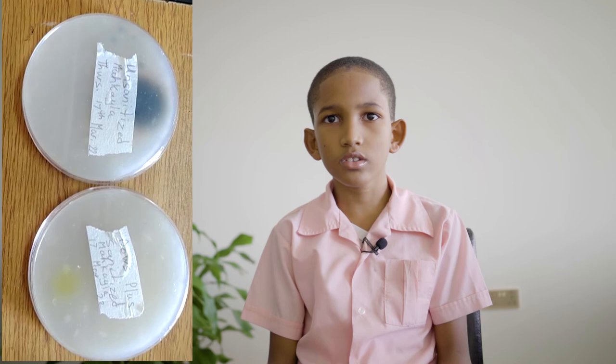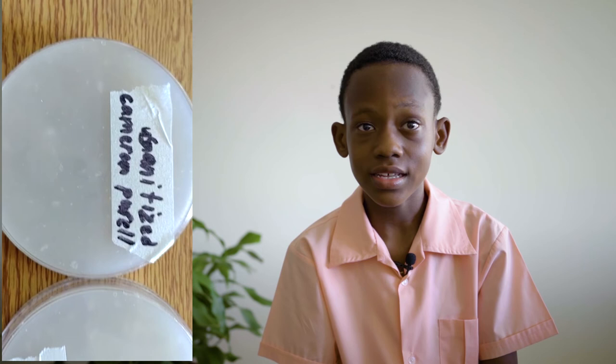The amount of alcohol in the nine sanitizers used ranged from 62% to 76% alcohol. The amount of alcohol didn't have a very big effect on the growth of bacteria. When compared to another gel sanitizer, Dews Plus, with 75% alcohol, the locally made Blue Caribbean Spray produced less bacterial growth. It appears that the spray as well as the higher alcohol percentage works best. Four out of the nine sanitizers claimed to eliminate 99.9% of the bacteria, but none of them did.